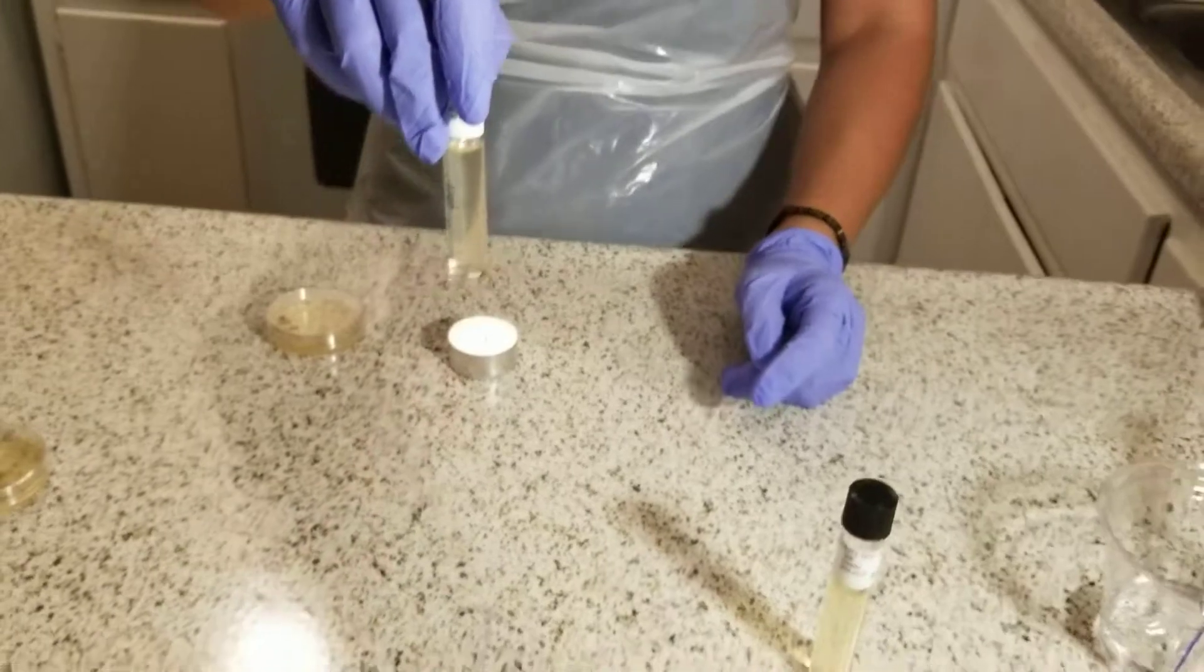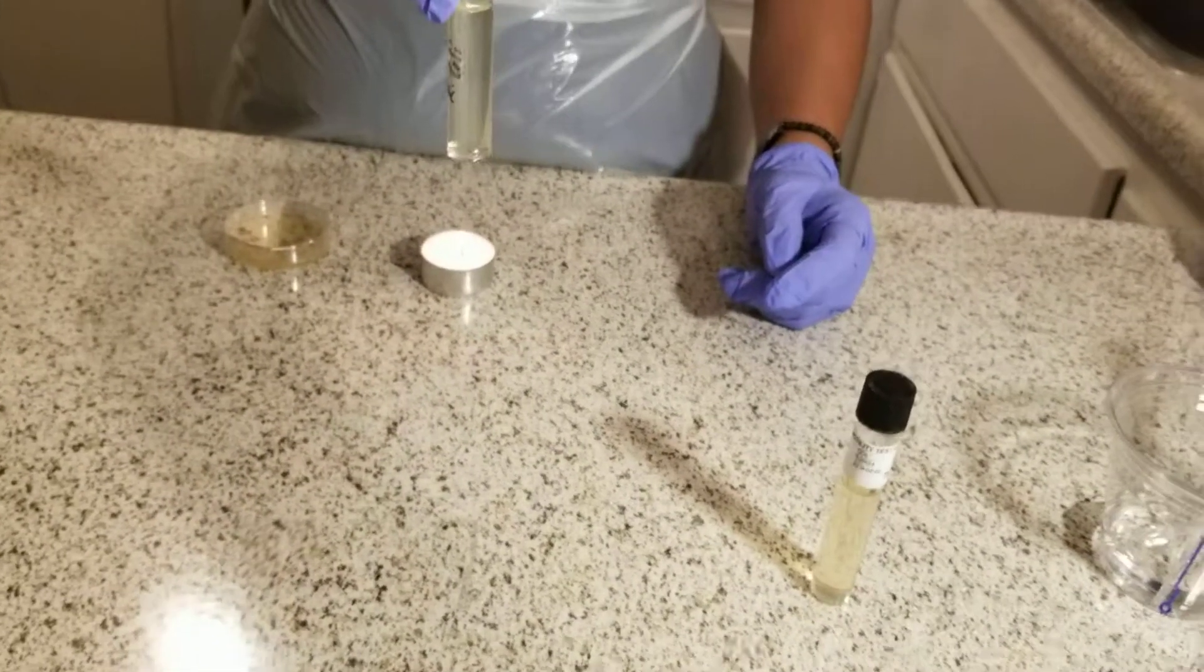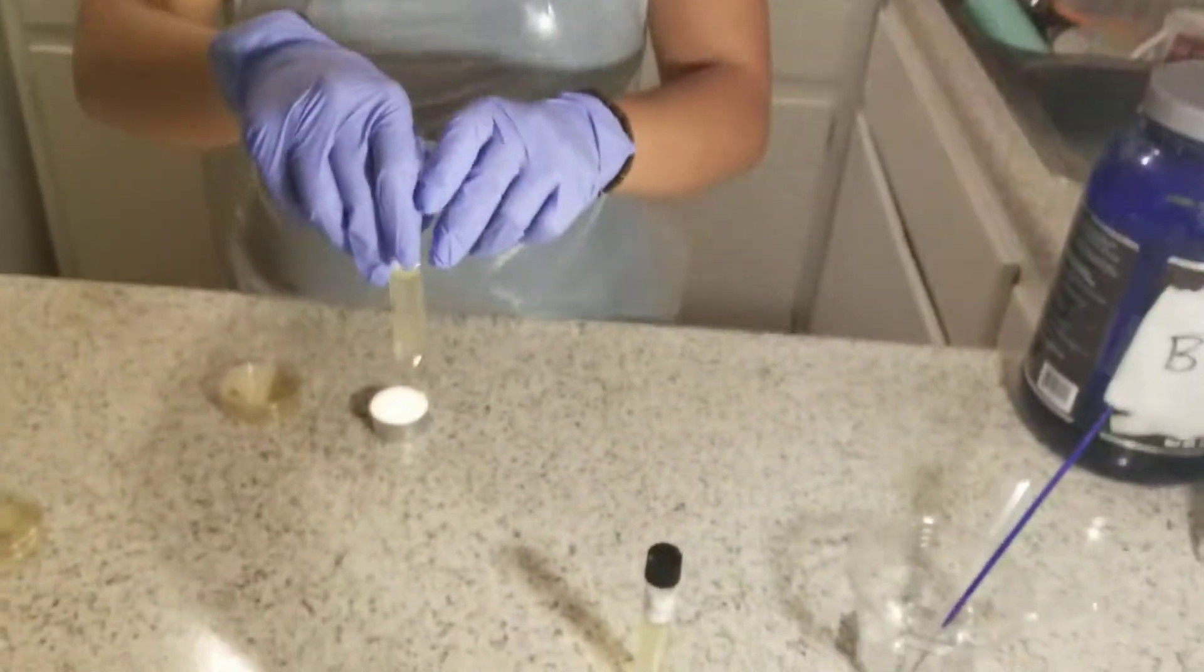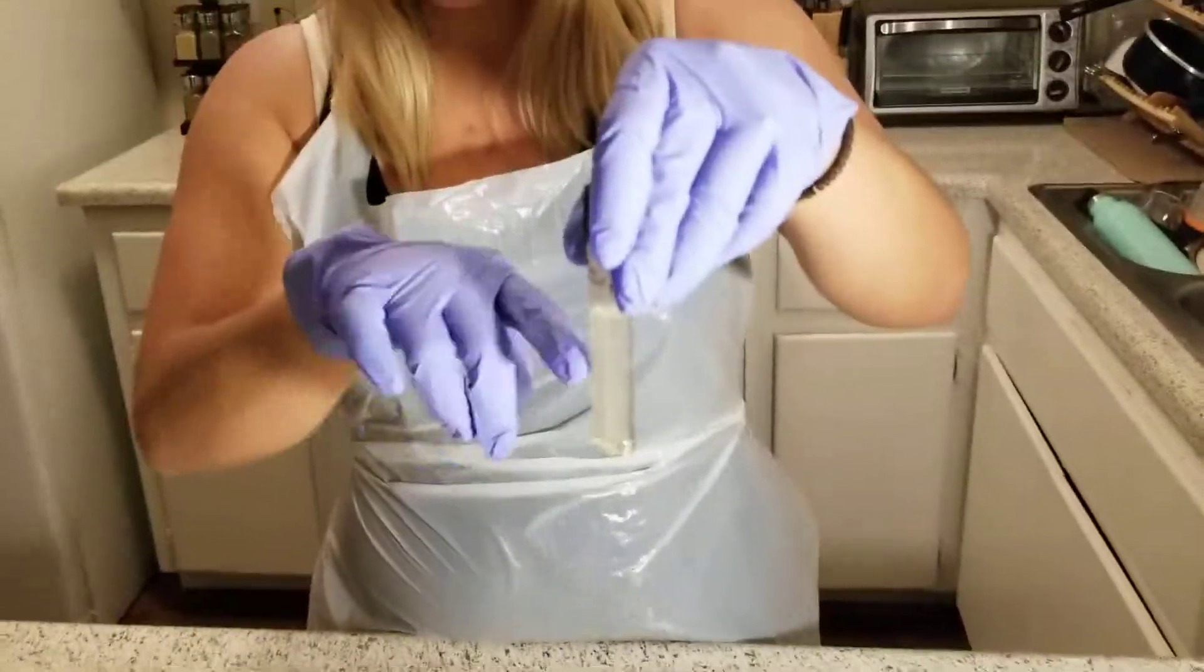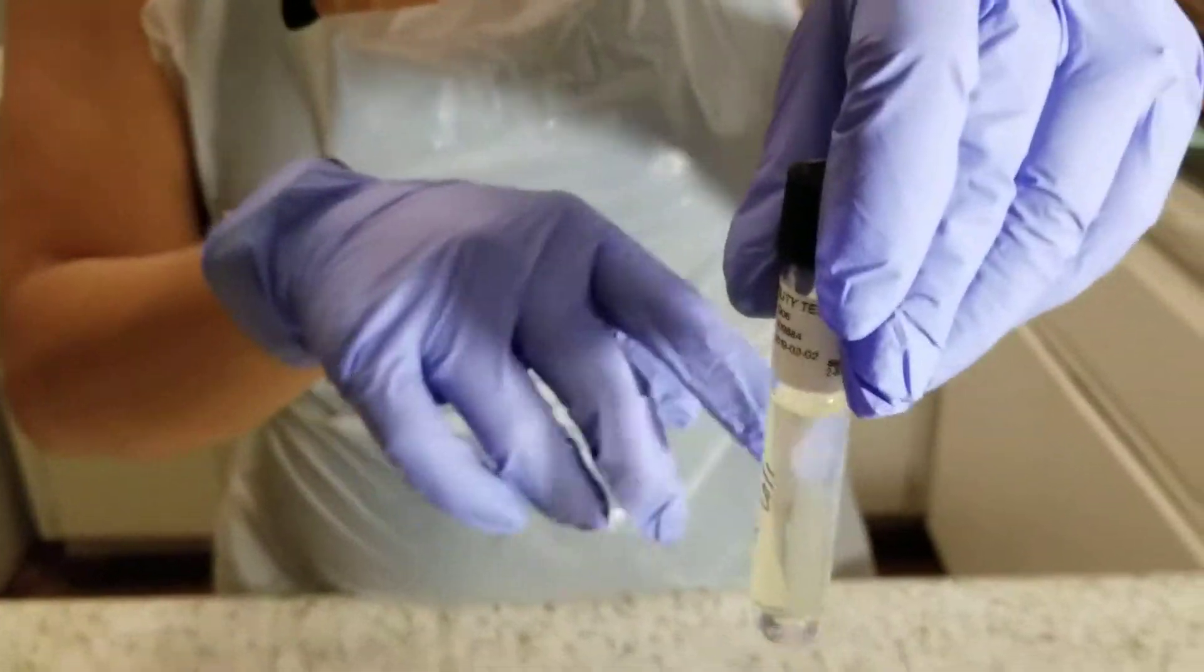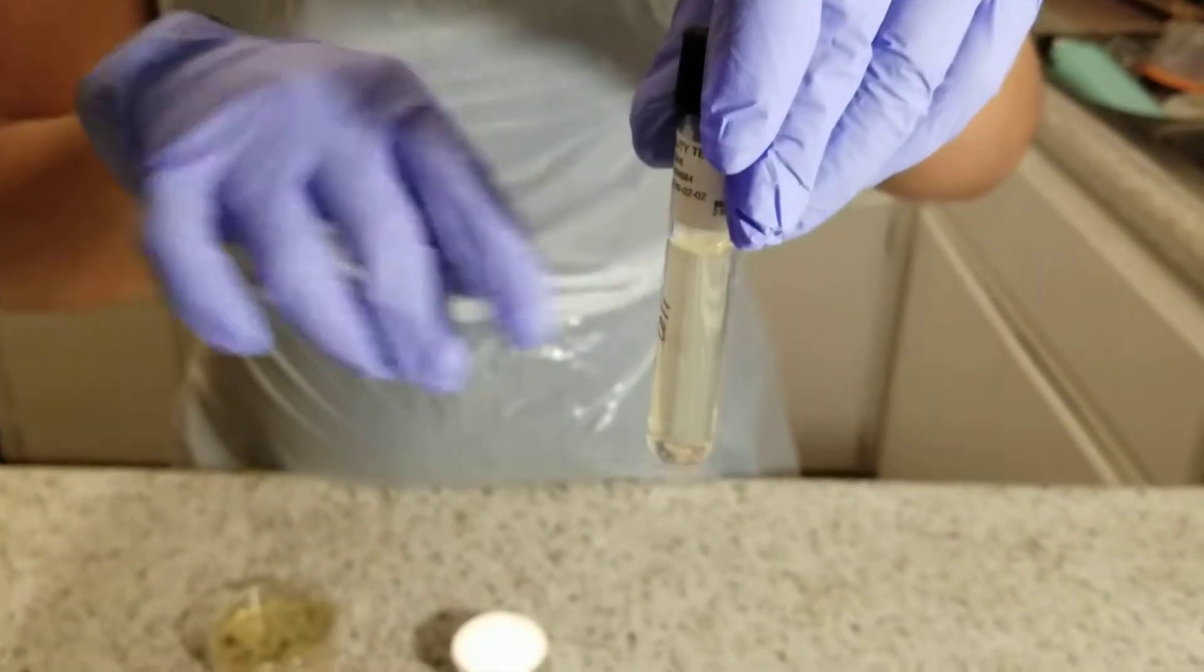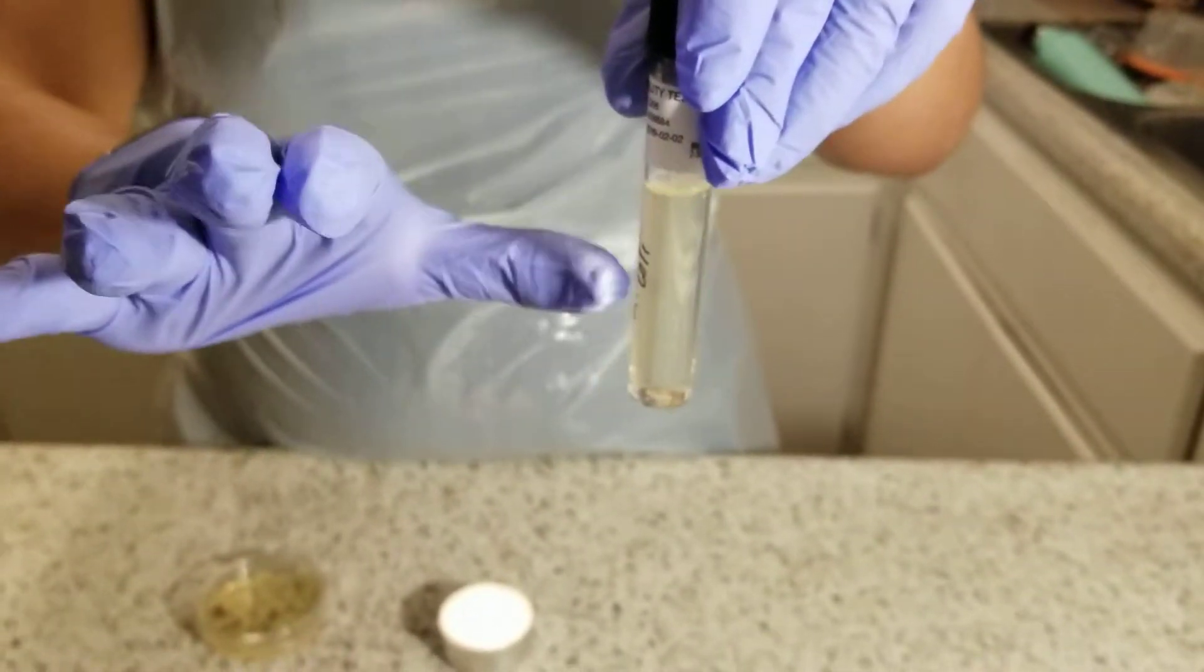After 48 hours, I'll observe the tube for motility. If there's positive motility for E. coli, I should see turbidity within the tube. If it's negative, there will be no turbidity and it will be clear.